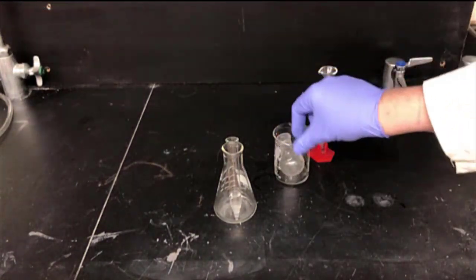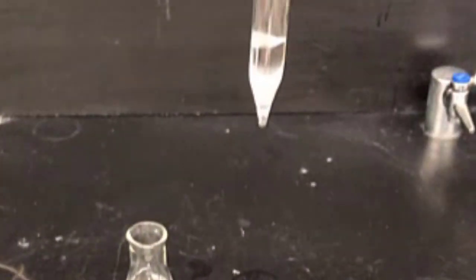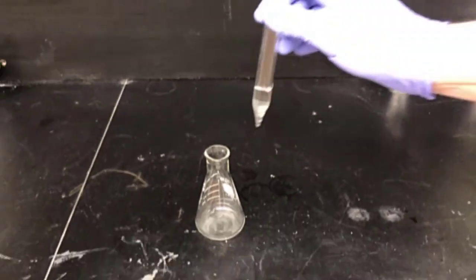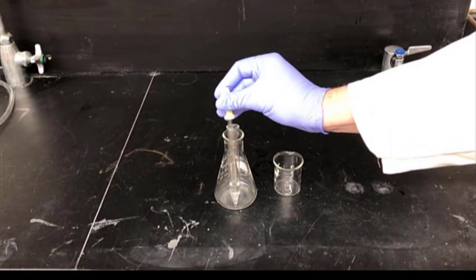The test tube will have two phases now. There's a lower aqueous layer which contains the peroxide and hydroxide, and then there's an upper layer that contains ether and the dissolved organic materials, including the products. Remove the lower aqueous layer and discard it.